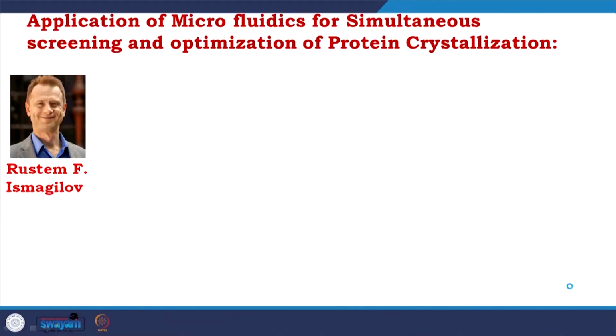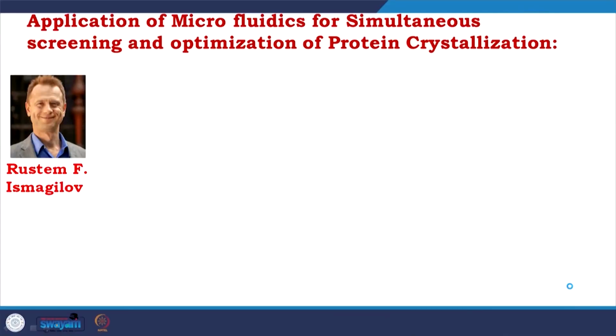So, as I told, the application of microfluidics for simultaneous screening and optimization of protein crystallization. I was fortunate, I was doing my PhD at University of Illinois Chicago, and Rustem Ismagilov was at the University of Chicago at that time, and he developed microfluidics-based crystal screening.